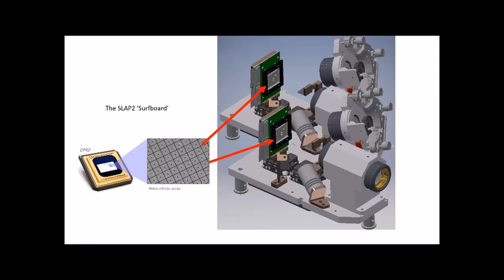Okay, so this has all been pretty abstract. Let's make it a little more concrete. The way this microscope works is we generate a line of excitation, which we scan very fast across the DMD. The line scans roughly 20,000 times a second across the DMD. For any given line scan, we're going to have a different pattern of mirrors on in the DMD, right?